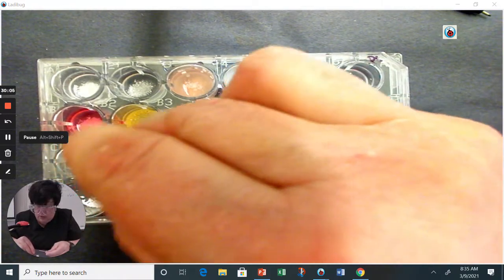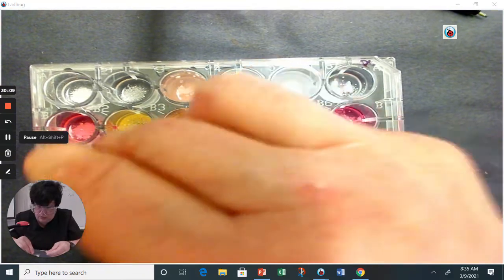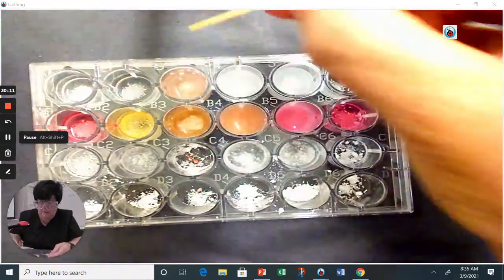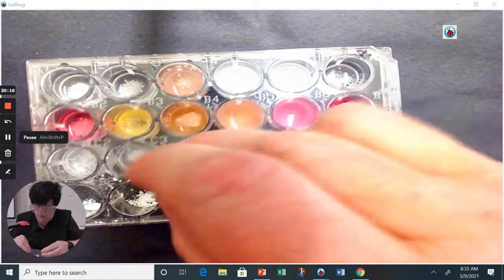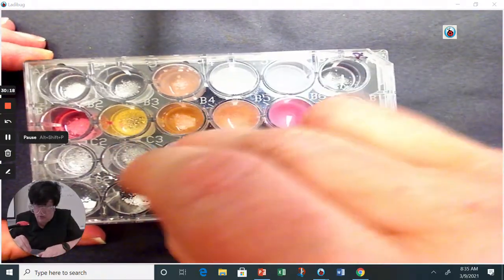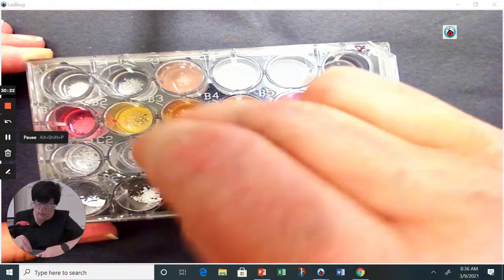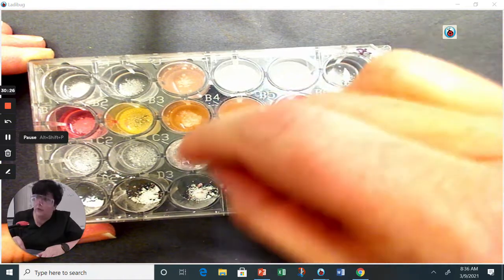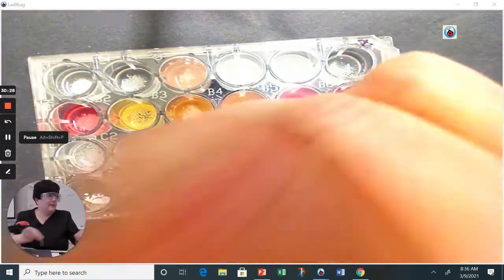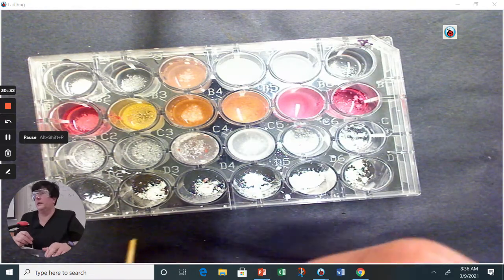If these were really unknown and I didn't know they were over-the-counter medicines, I would use a new toothpick and not touch the solution. But I know that they're over-the-counter medicines, which we take and ingest, so I'm not worried about touching them after they're powdered. I will definitely wash my hands. I hope not, I'm recording.